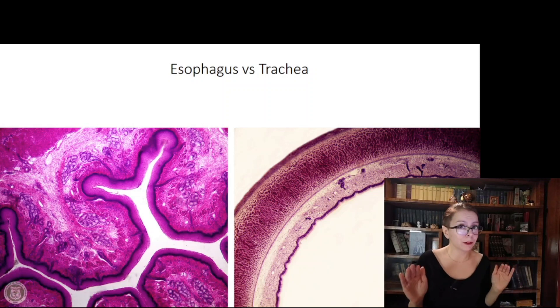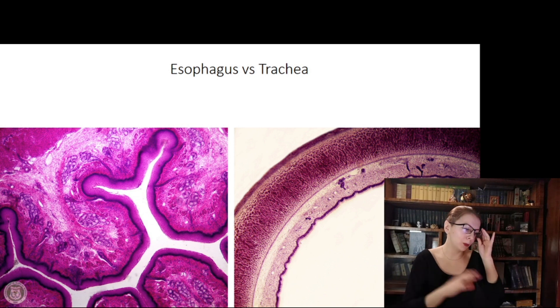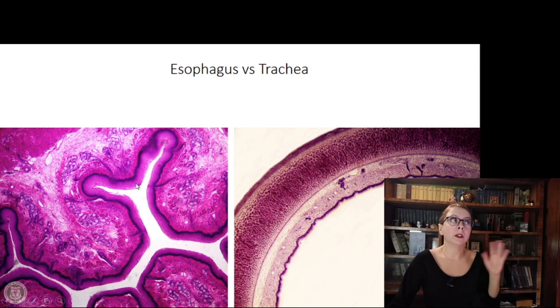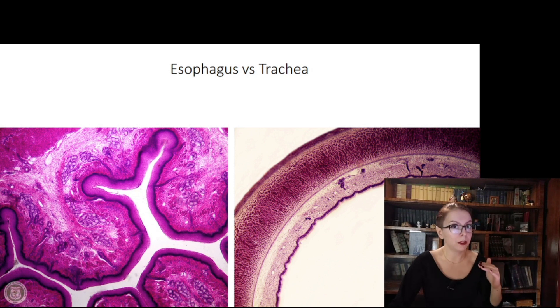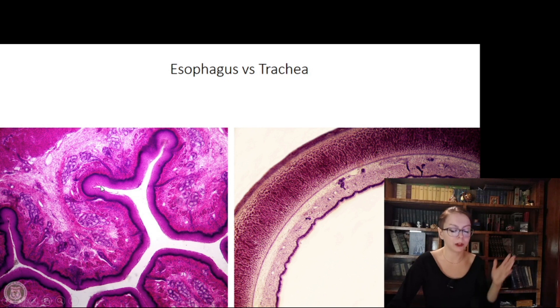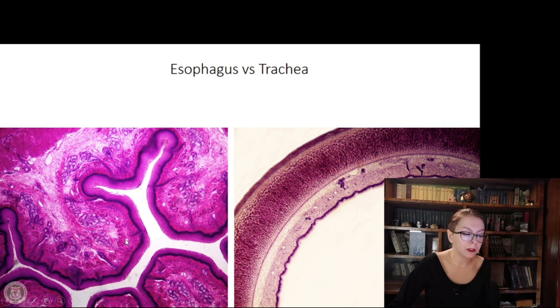Now we have the esophagus and the trachea — very easy to distinguish, though both are tubular hollow organs. In the esophagus, we have stratified squamous non-keratinized epithelium, which is very unique for the digestive tube. Starting from the stomach onwards, we have only simple epithelium up to the rectum. So if you see a stratified squamous hollow organ, this should be the esophagus.